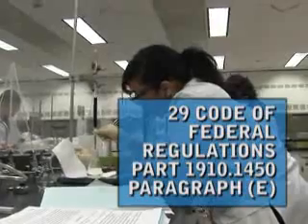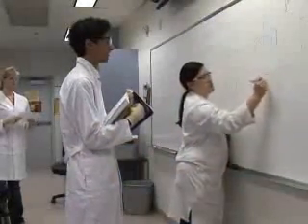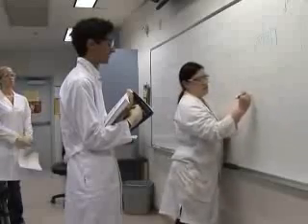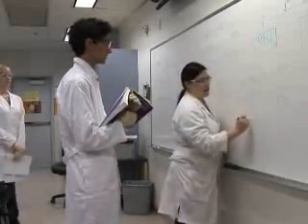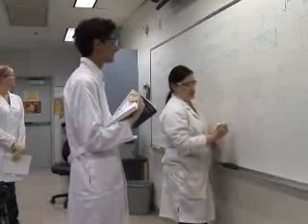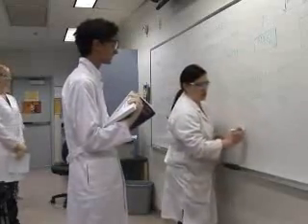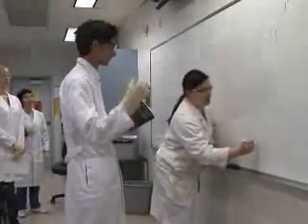1910.1450, Paragraph E. For the purpose of this program, a laboratory worker is a principal investigator, course or laboratory instructor, faculty member, technician, laboratory assistant, teaching assistant, research assistant, student, or visitor to the laboratory.